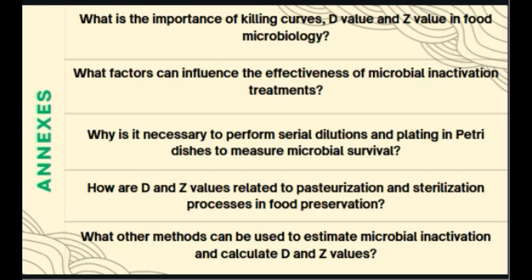Okay, the next question is, what factors can influence the effectiveness of microbiological inactivation treatment? These factors affect the experiment. The temperature: the treatment temperature can affect the rate of inactivation of microorganisms, with higher temperatures generally being more effective. The exposure time during which microorganisms are exposed to the treatment also affects effectiveness.